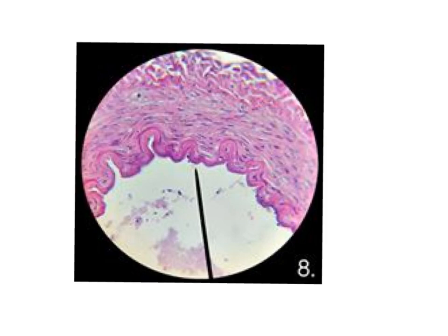Under the microscope, it has a very characteristic picture, which is the thick, well-developed internal elastic lamina. And the media and externa are almost similar to each other. The wall is thin. So this is the basilar artery.